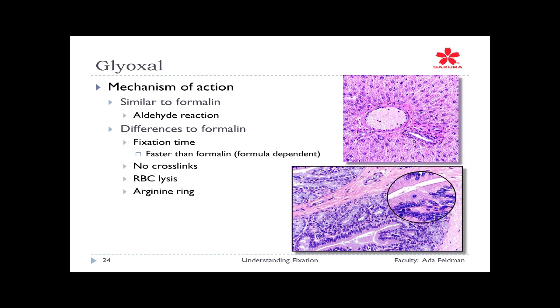So they were forced to put other additives and solvents in, and one of the things several of the manufacturers put in was a very small amount of alcohol. And that was there to help the penetration. Now, the amount of alcohol that's been added is just enough to get it through that cell membrane, break through it. And it's not an alcoholic fixative like alcoholic formalin is, but it's just enough. And that, therefore, speeded up the glyoxal to get in.